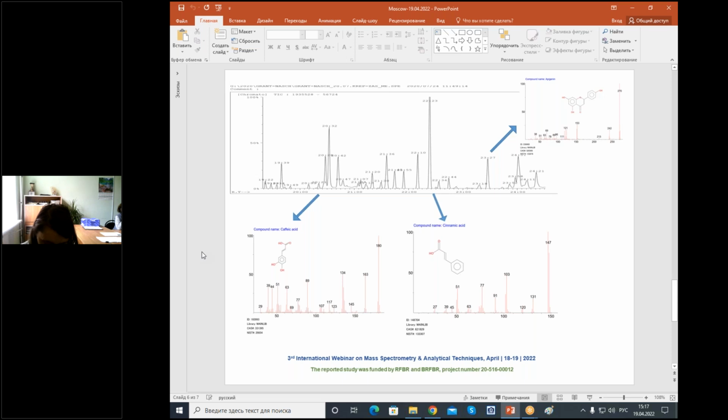It is malonic acid by 70 times, myoinositol by 40 times, caffeic acid by 23 times, tartaric acid by 15 times, glycerol by 7 times, L-proline and serine by 4 times, and glycolic acid, oxalic acid, and lactic acid by 2-3 times.